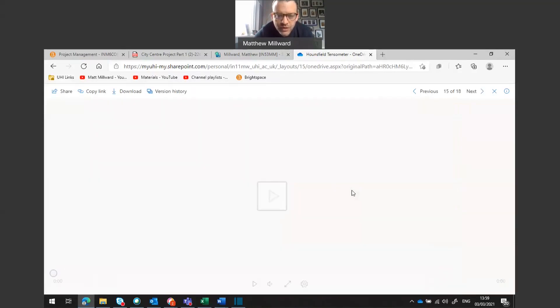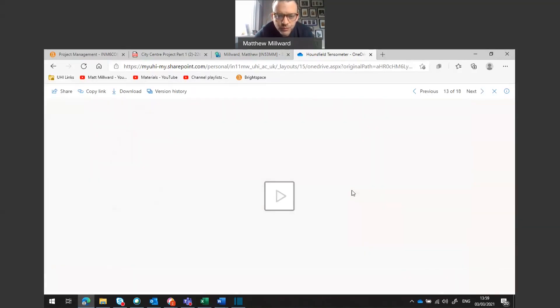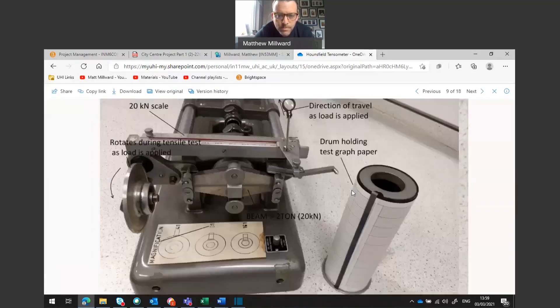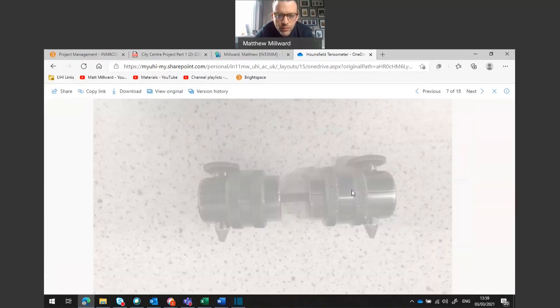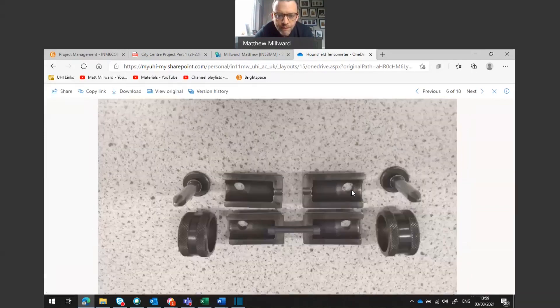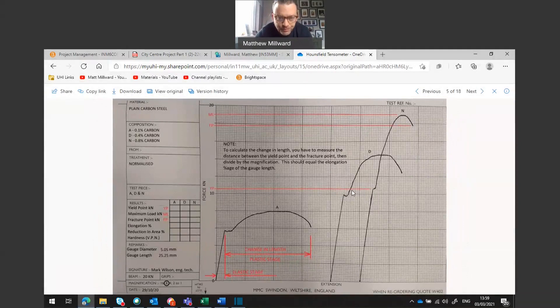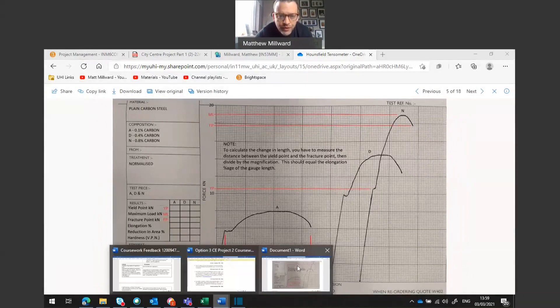Now we'll go back to the graph. This is the graph that was done for the three samples that we have looked at. I'm just going to pull this up so we can annotate it a little bit and fill in some parts of our result sheet.